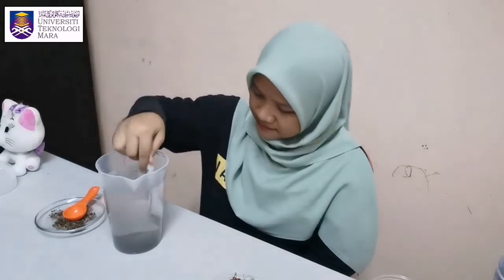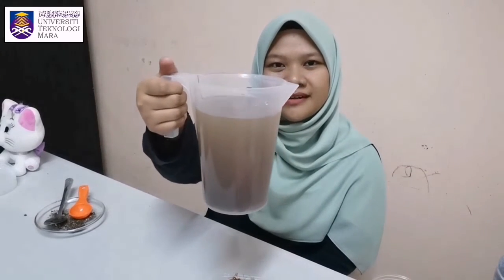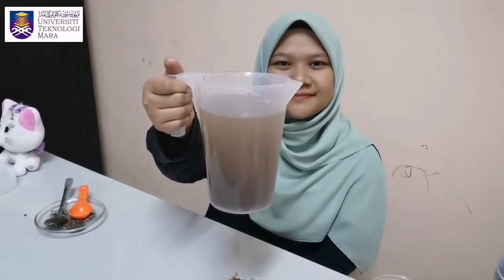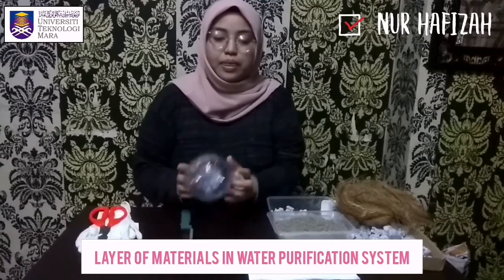We start the experiment by preparing the raw synthetic water. First, take 1 tablespoon of soil and put it into the raw water. Next, stir and mix the raw water. And here we are, our raw synthetic water. I will show how to layer the materials into the bottle to make the purification system.